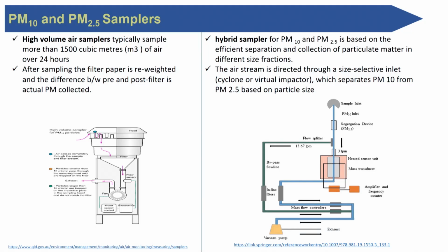You have a PM 2.5 and PM 10 sampler, like I have already explained in the previous lecture. The air comes from here, and you can imagine a bigger particle is deposited here in the greased surface. The remaining air, with the smaller particles, goes up and bounces back, and then you have a fan to control the flow rate.